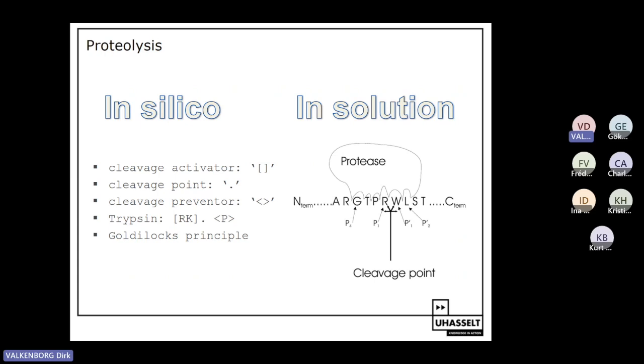And I told you in the last session, the most important protease in shotgun proteomics or bottom-up proteomics is trypsin. And trypsin allows us to cut on arginine or lysine, which is the amino acid one-letter code R or K. And if we do that, we ensure that there is a basic amino acid at the C-terminus of the peptide. And that is pretty interesting because that basic C-terminus will most likely attract a proton during the ionization, making us have a charged C-terminus.